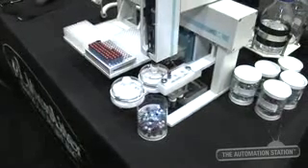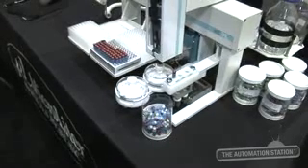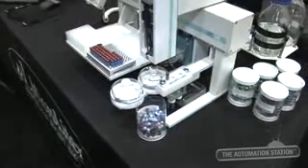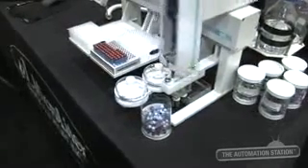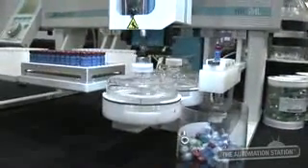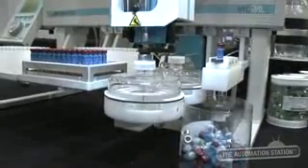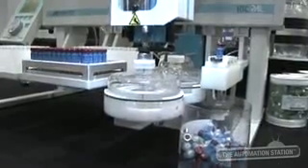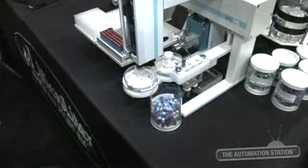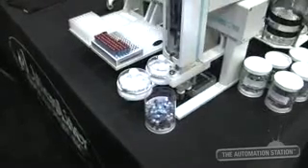We will help you by providing raw devices that you can use manually, and then we will write the automation and come to your lab to show you the demo. You can actually run samples during the demo to replicate your manual method that we've transferred. We are washing the column now. We generally see solvent reductions of 70%. The labor is obviously nonexistent except for prep of the actual supernatant if you need to do that.